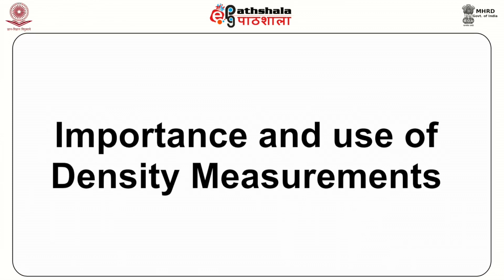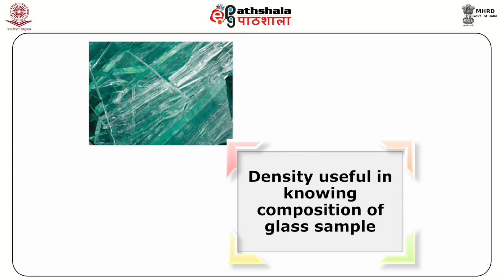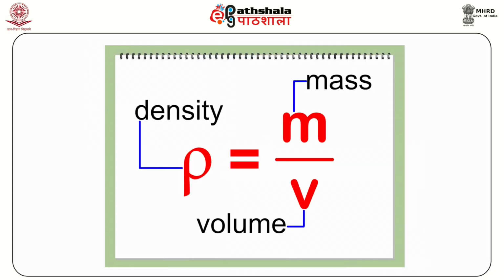Importance and use of density measurements. Density can be useful to help know the composition of the glass sample. It is defined as mass per unit volume of the sample.